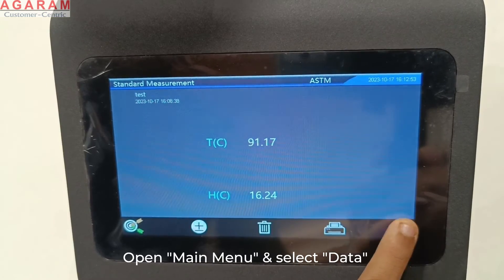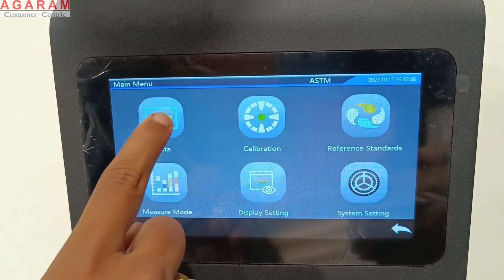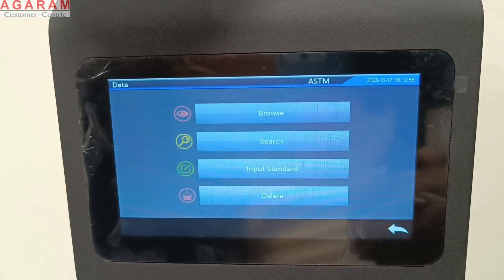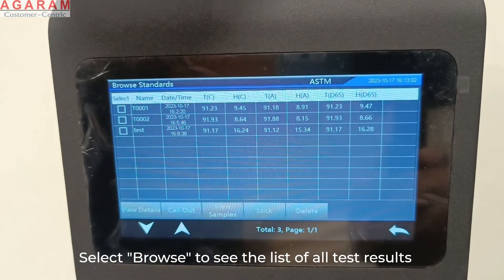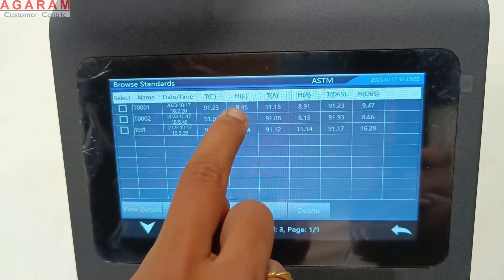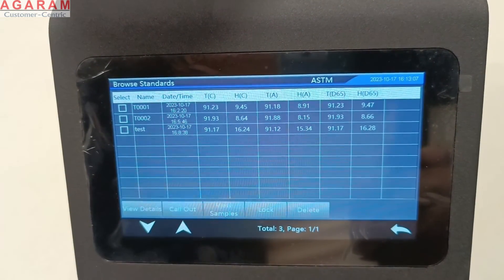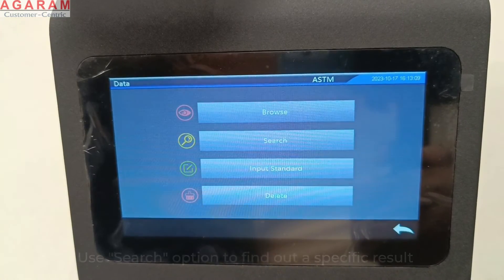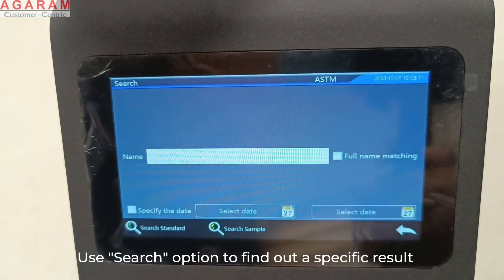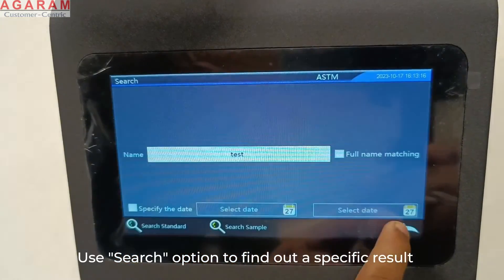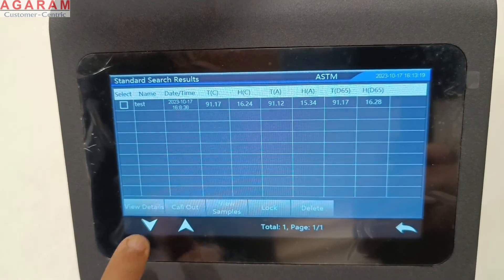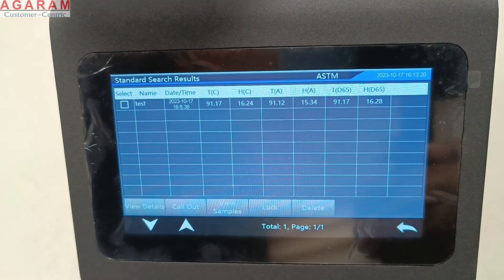To recall the saved data, open the main menu and click data. By clicking browse, you can see the full list of measurements taken so far. You can also use the search function to find a specific test data, and download all the preferred results.